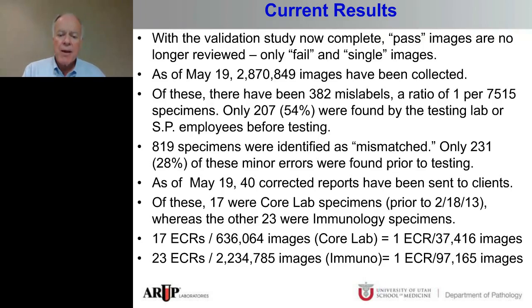What that meant was that the OCR was actually in time. I should mention that we don't review these OCR images right on the spot. The review by an employee is the next day, or in the case of weekend specimens, on Monday. So it's after the fact.